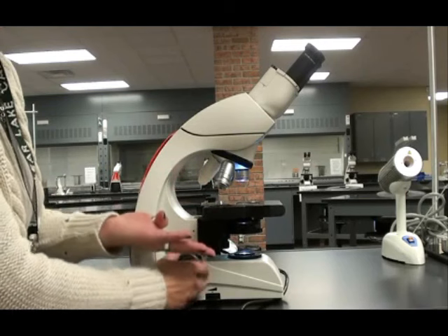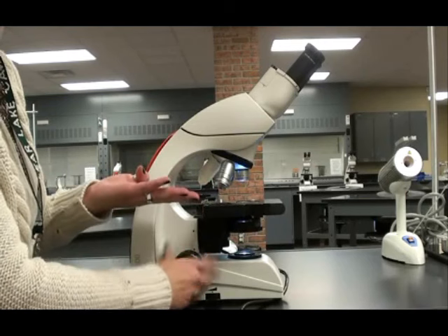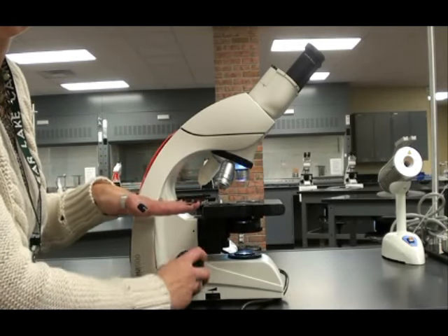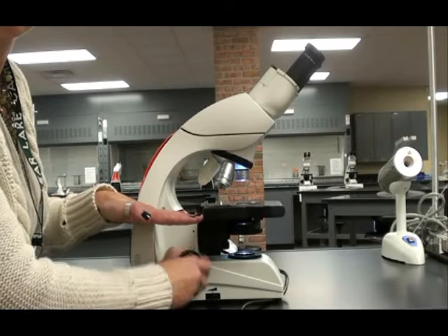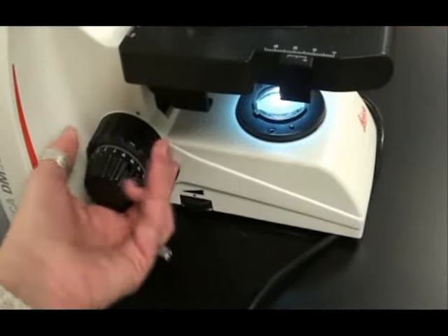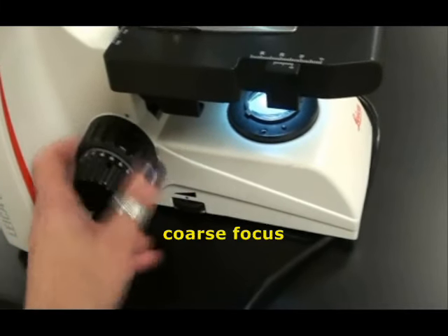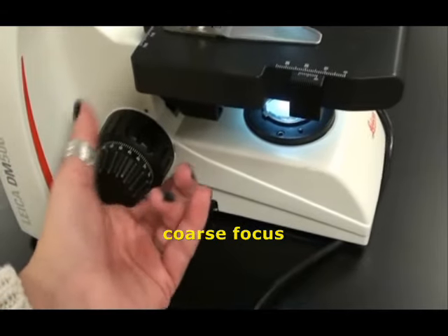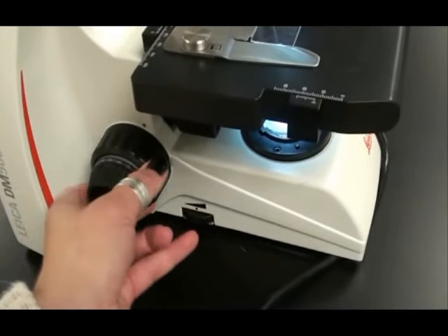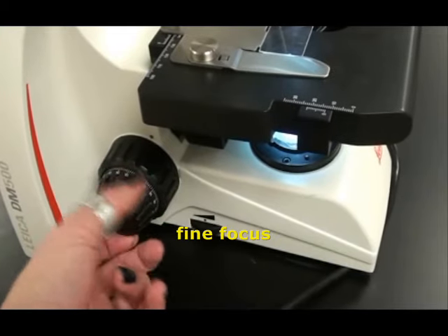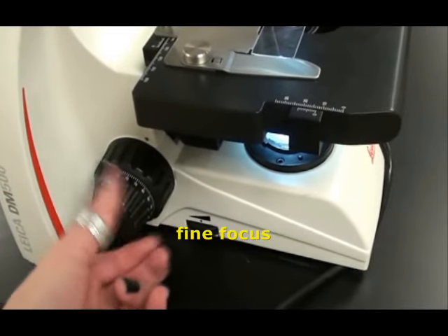The focus knobs raise and lower your stage, and the vertical position of your specimen is what determines whether it's in focus or not. On this scope, the coarse focus can be adjusted by turning the part of the knob that's closest to the body of the scope. The fine focus can be adjusted by manipulating the outer portion of this knob.